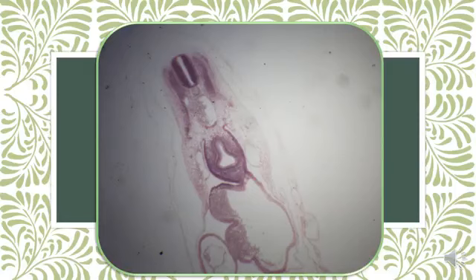More caudally you can see, dorsally, this is the neural tube. Ventral to the neural tube, the notochord. You can see the loose tissue surrounding the neural tube and the notochord is called the sclerotome, while the dense tissue is the dermomyotome.